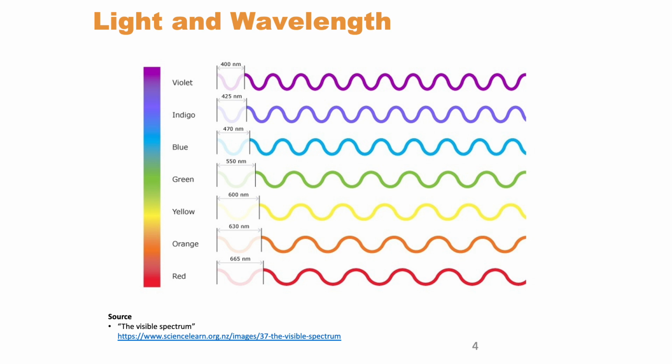Before we talk about flow cytometry, we're going to have a brief review about light, which is the basis for flow cytometry instruments. We can all see colors based on the wavelengths given out by a specific product. So the product is what gives out the wavelength, and so we see different things in life with different colors.